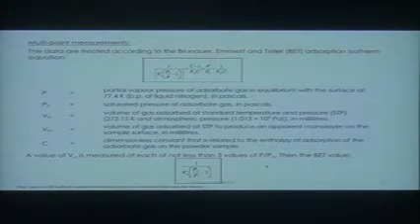So the BET technique essentially works on adsorption, typically of nitrogen. So you cool this system down to cryogenic temperatures, and you measure the adsorption processes.